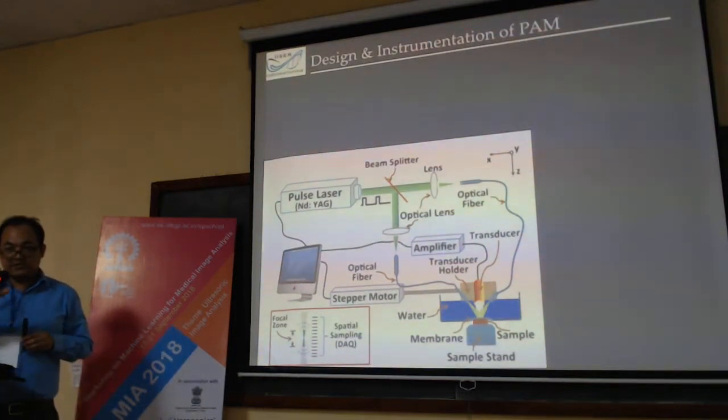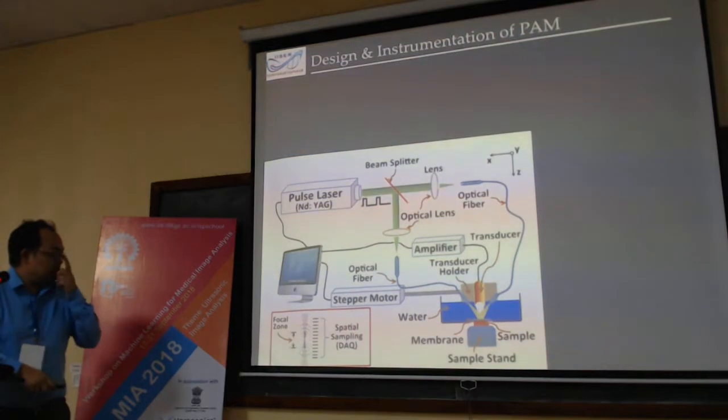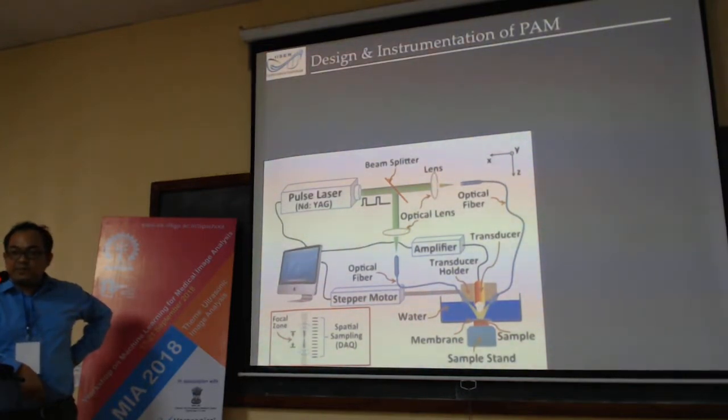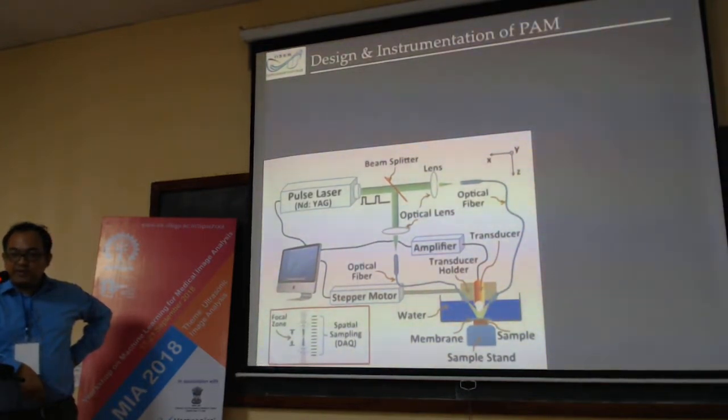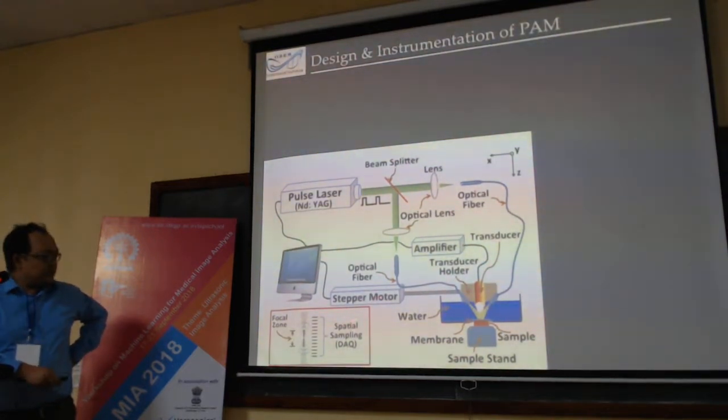Here is the one confusion: scanning in 2D will give the 3D data. So this is about the requirement. This movement is of the order of micrometers, so we cannot do it manually. It has a number of steps, so it has to be controlled by a stepper motor.